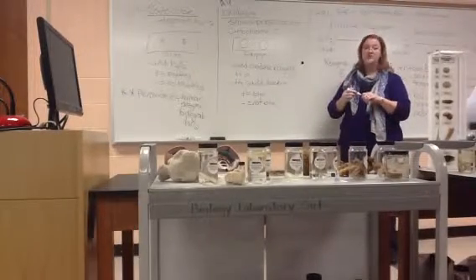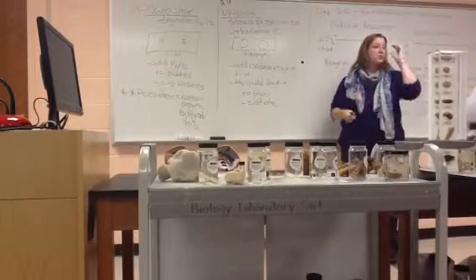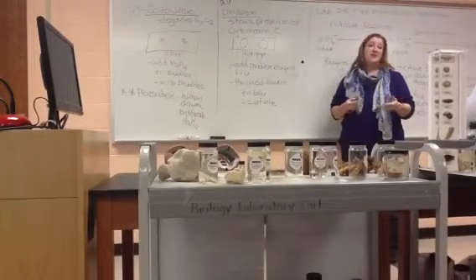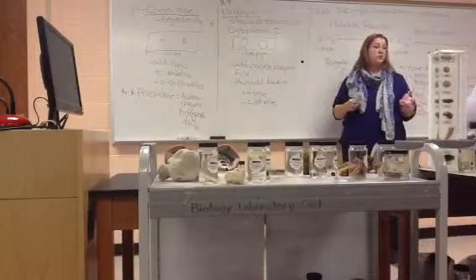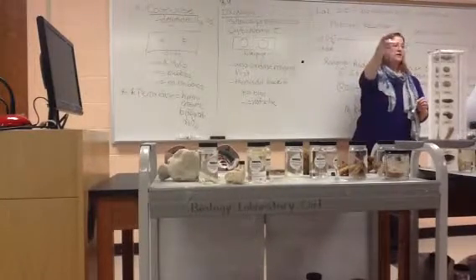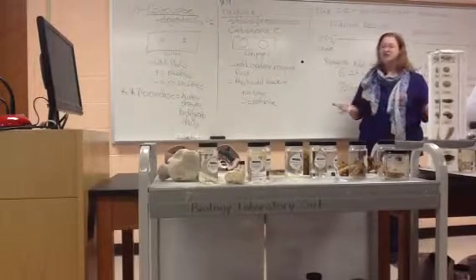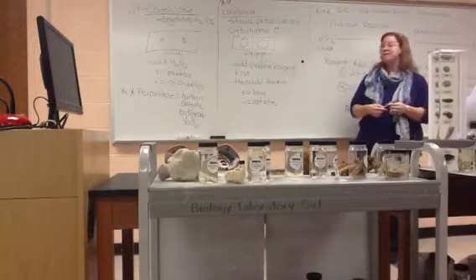And if you read through the procedure for this, your lab book says not to use the inoculating loop because the metal is supposed to give you a false positive. I've honestly never had a false positive, so you can use the loop if you want to, but if you want to follow the rules of your lab book, there's also some wooden applicator sticks on your table in a box. Allegedly, the metal gives a false positive, but I've never seen it, so it's up to you.